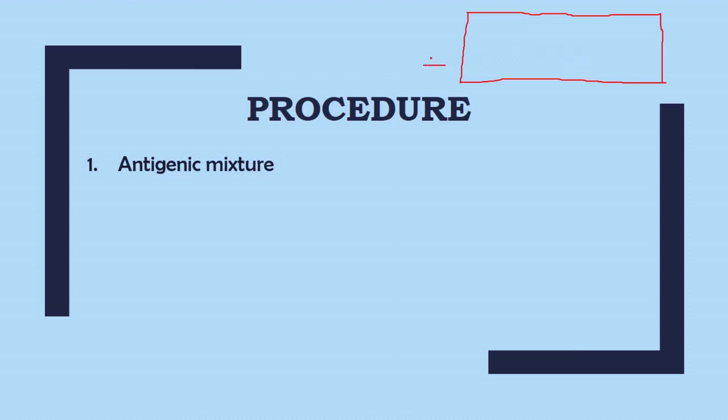If we are going to charge this side of the gel with the positive electrode and this side with the negative electrode, where should we bore the well? Since the antigen is a mixture with different charged antigens, we want to put it near the center, so that whatever charges they are carrying, they can move. Either positively charged will move towards the negative electrode, or negatively charged will move towards the positive electrode, and so forth. Then you would ask me why I have not put the well here, or here. I can put it here, fine, but not in the center.